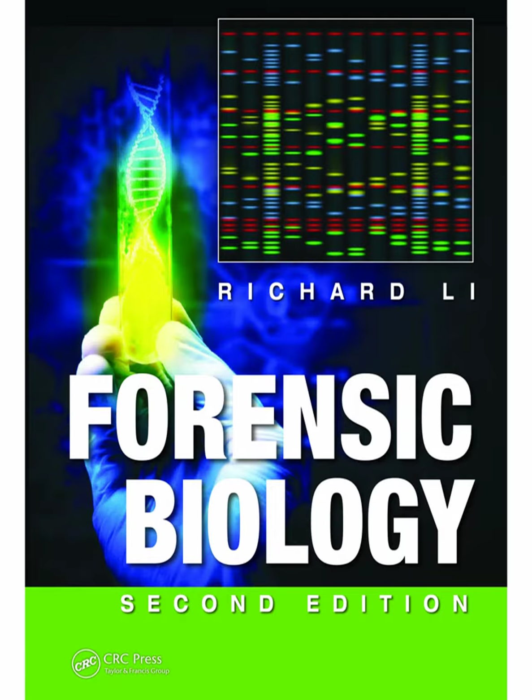So both fluorescence and Raman offer the potential to identify the fluid first, confirm its relevance, and then proceed with DNA analysis on the very same untouched spot. That's the goal. Maximizing the information gained while preserving that precious evidence for downstream DNA profiling. It's about getting the most out of often limited material.